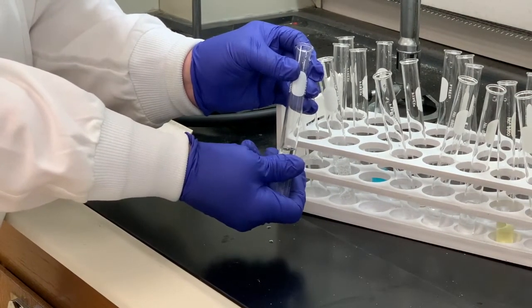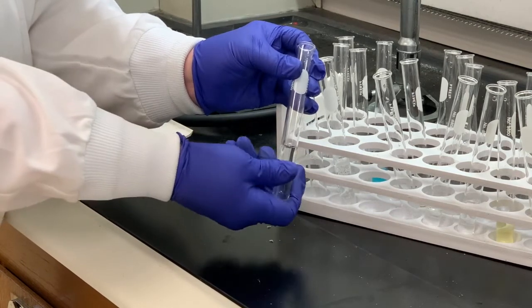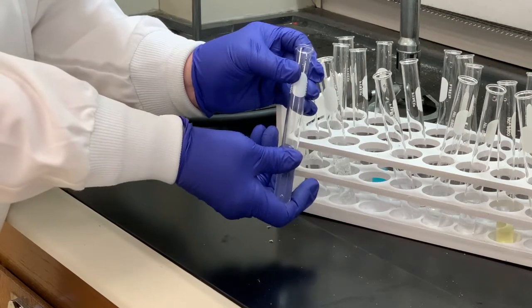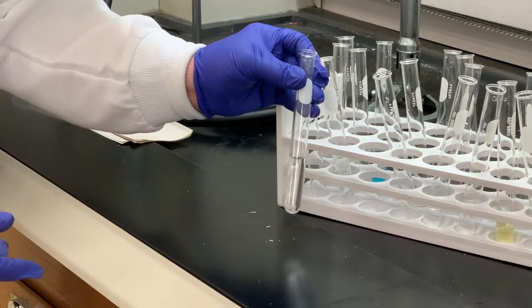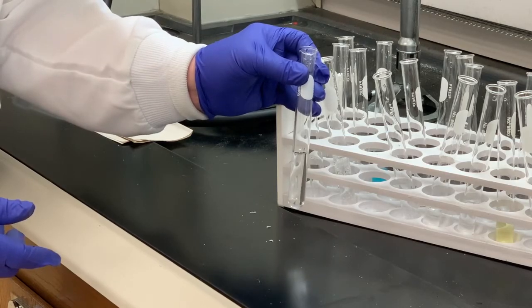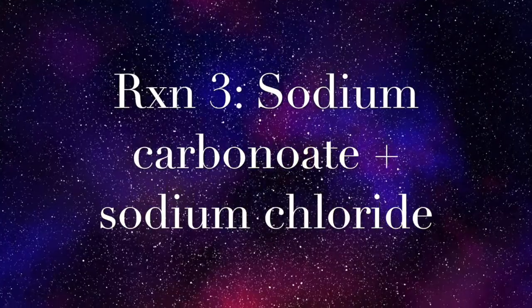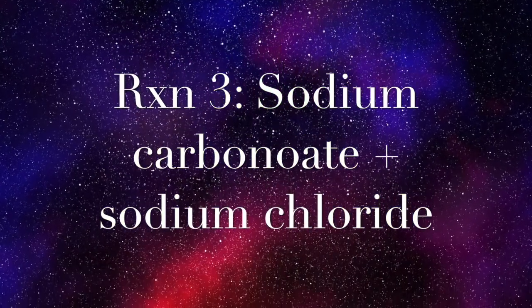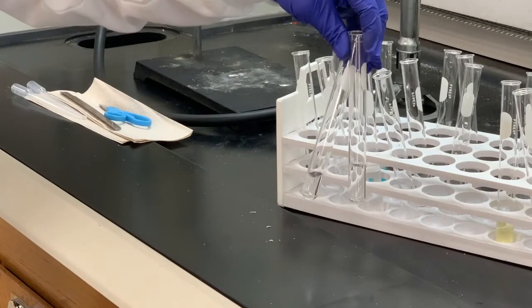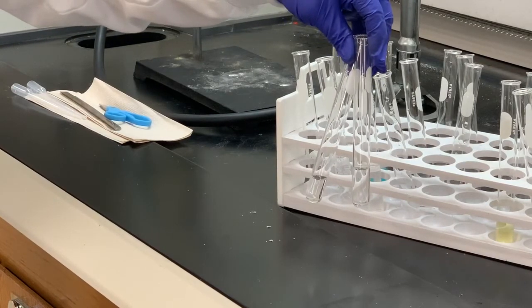But it is a slight exothermic reaction, so it is a little bit warmer to the touch. So remember, if we notice a heat change, we need to record that as well. So since we did see a heat change, did a reaction occur? We would say yes. The third set of reagents is sodium carbonate and sodium chloride. Again, two colorless solutions that we're using.